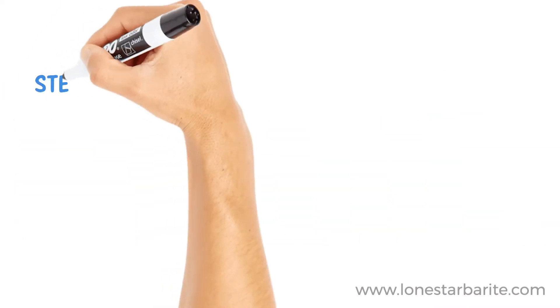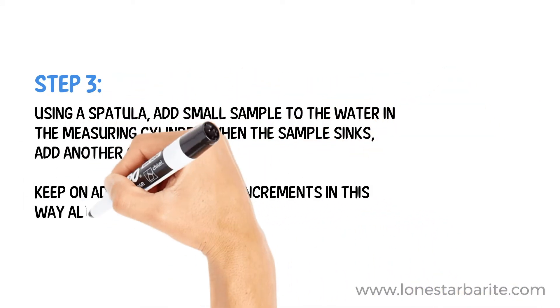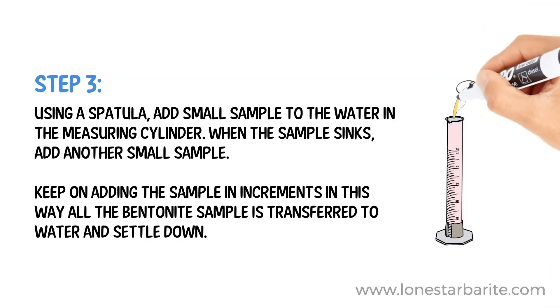Step 3. Using a spatula, add a small amount of sample to the water in the measuring cylinder. When the sample sinks, add another small amount. Keep on adding the sample in increments. In this way, all the bentonite sample is transferred to the water and settled down.